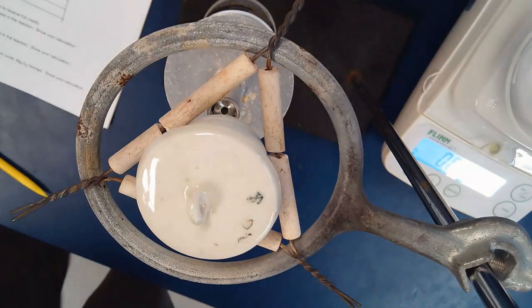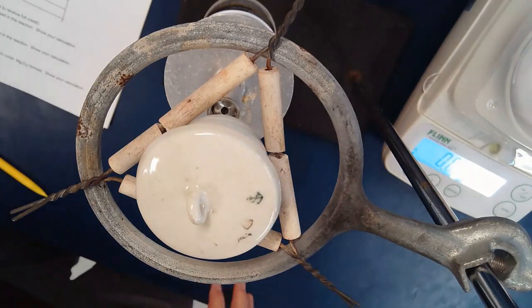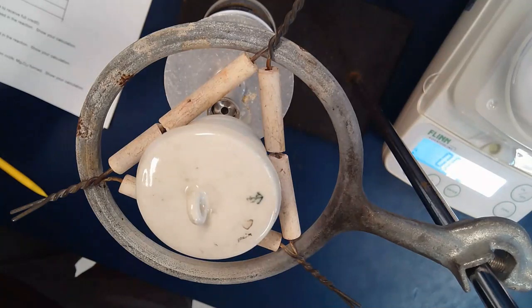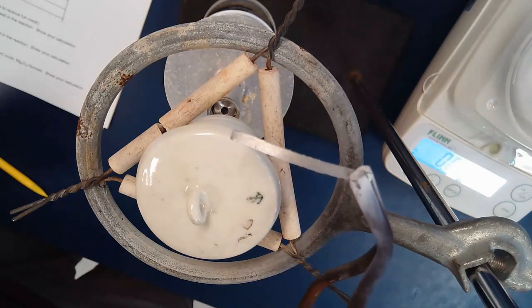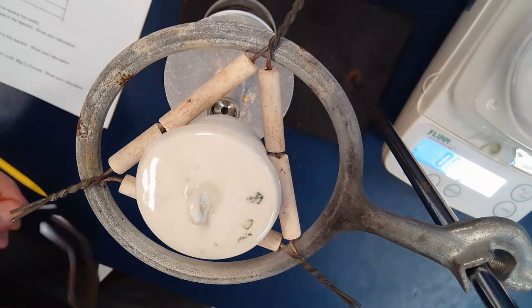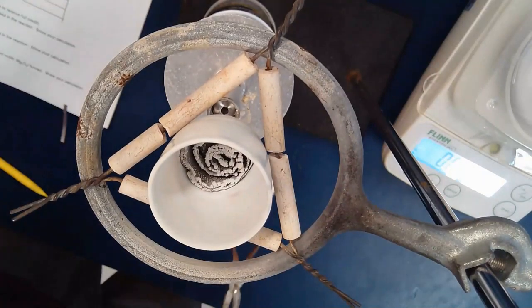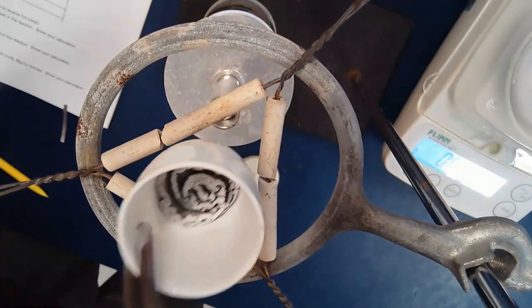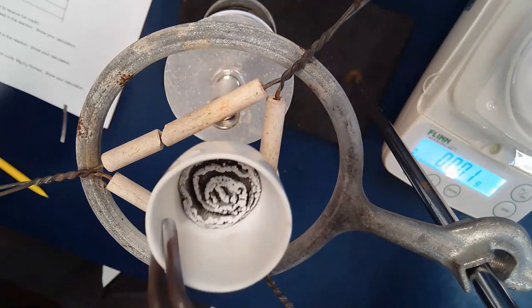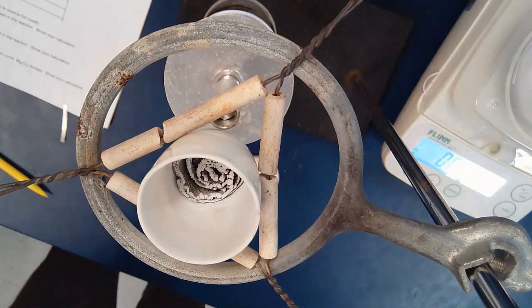All right, fellas. So we let this heat for about 5 minutes, and right now it's pretty cool. But we're going to give you a quick before and after. So just recall that the magnesium looked like this. It was a nice, semi-shiny, kind of dull metal. And then we're just going to look to see what it looked like inside. So I'll remove the crucible lid, and we see that we have lots of what we hope to be magnesium oxide in here. Okay, so it's much, much different. And then we're going to go ahead and weigh this to get our last data point.